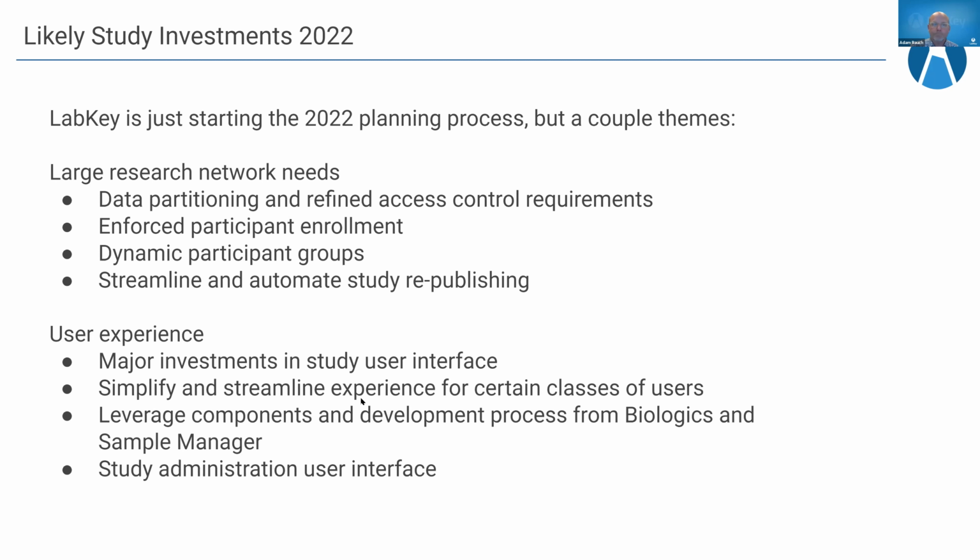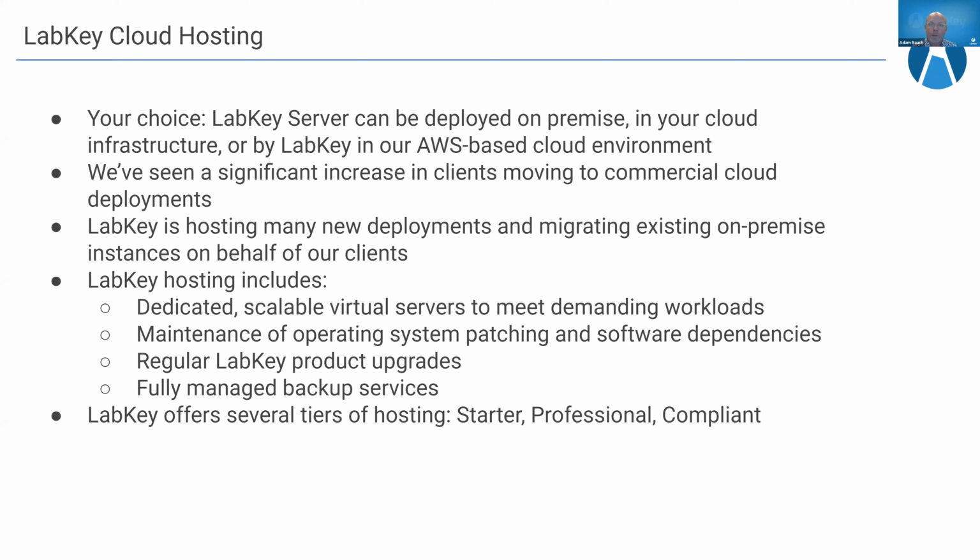So as Michael mentioned, you have a choice. If you want to deploy LabKey Server yourself in your own data center, that's fine. If you want to deploy it in your own cloud infrastructure, that's fine. But more and more, we are seeing our clients ask us, LabKey, to host their deployments for them. We do that within our AWS-based cloud environment. We run compliant instances for the FDA, for other research institutions. We have non-compliant instances. We've got a lot of flexibility and capability to deploy LabKey. We run hundreds of instances of LabKey in the cloud right now, and we're available if that's of interest.